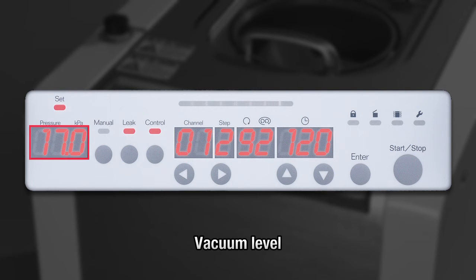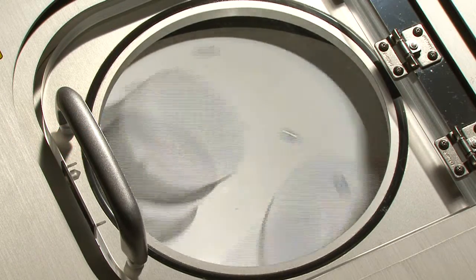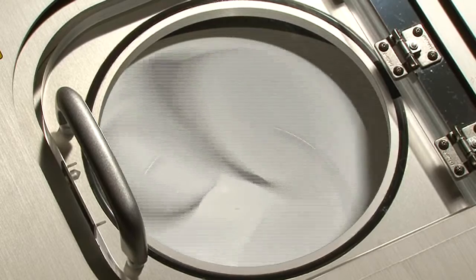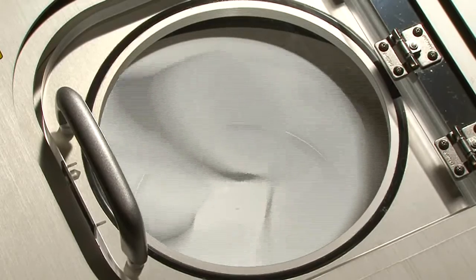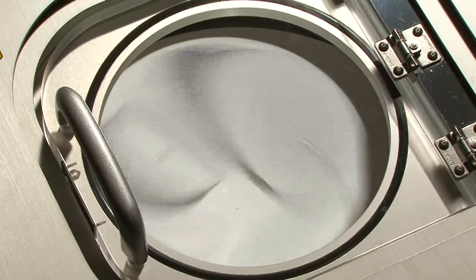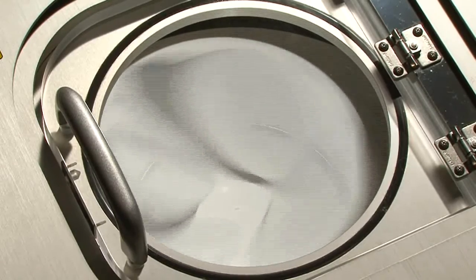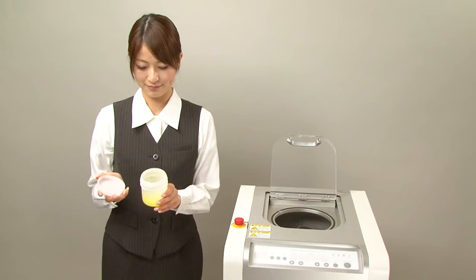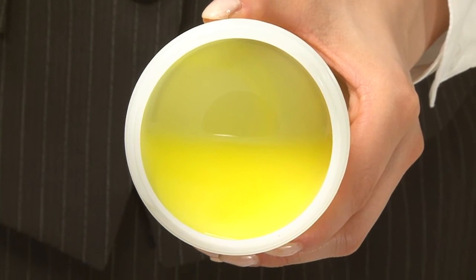The vacuum level is then set. Using the step mode with separate speed settings for revolutions and rotation, the rotation speed necessary for mixing and dispersion is maintained, while revolution speed is kept low to control precipitation and promote degassing. Furthermore, the degassing effect is augmented by vacuum decompression. See for yourself — using 2-step processing and a depressurized environment, materials of differing specific gravities have been completely mixed and degassed.